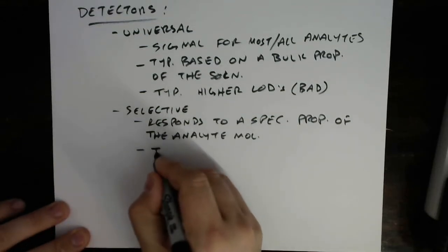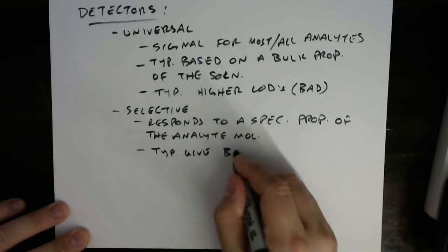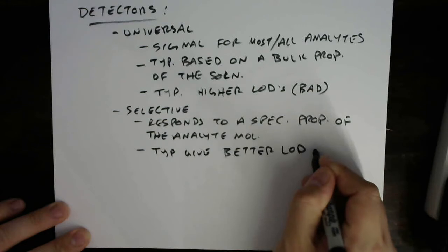As a result, these typically give better, or lower, LODs and higher sensitivities.